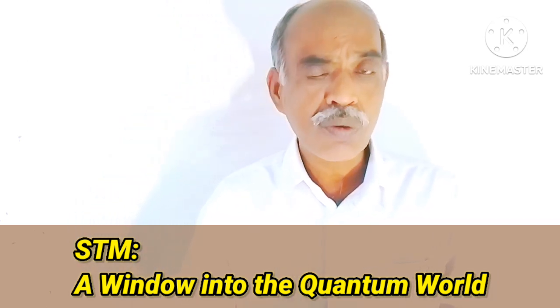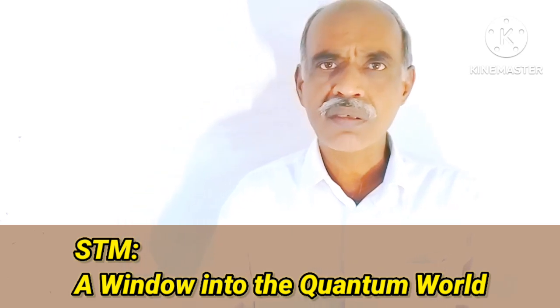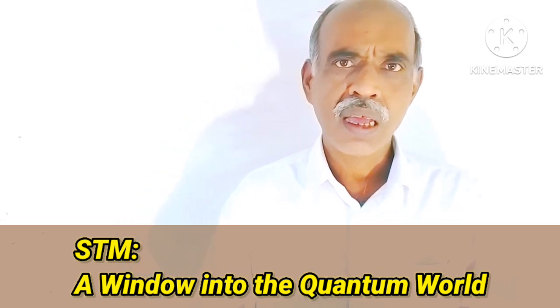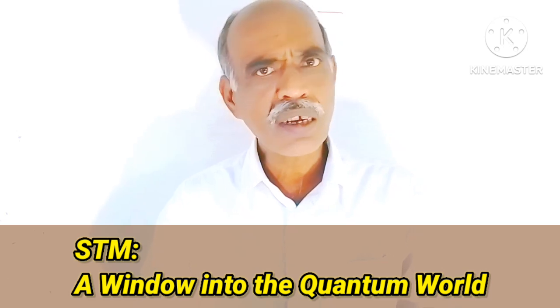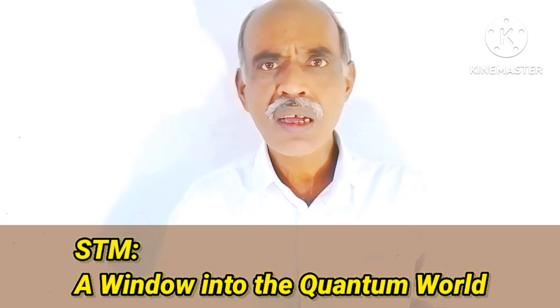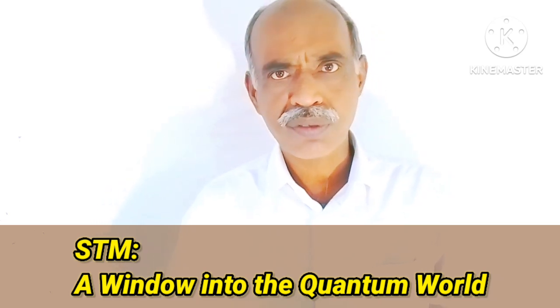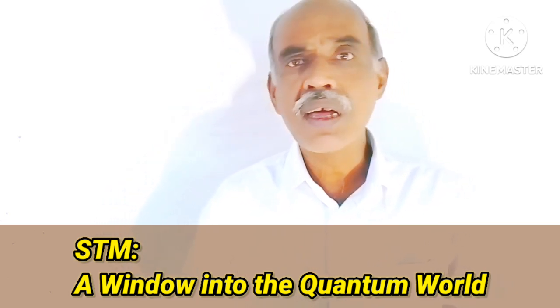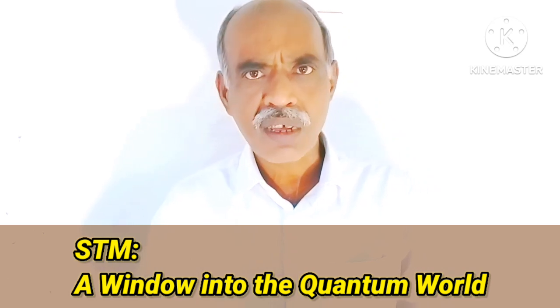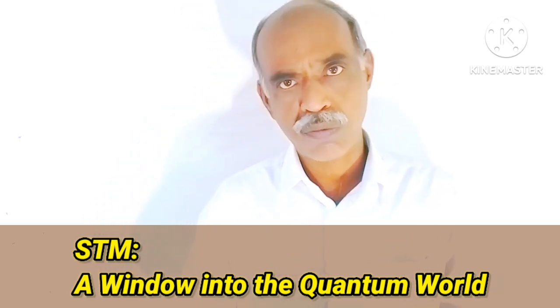And therefore what is the requirement? The requirement is to apply a voltage across the metal tip and the surface. That way a current is generated. Current flows across the gap. And just by measuring the current and moving the tip across the surface, we can see the atoms.